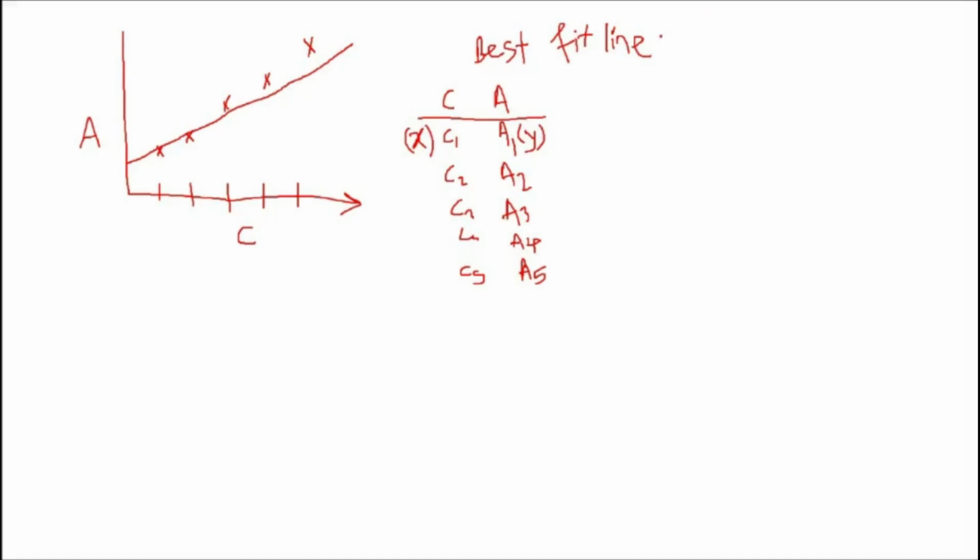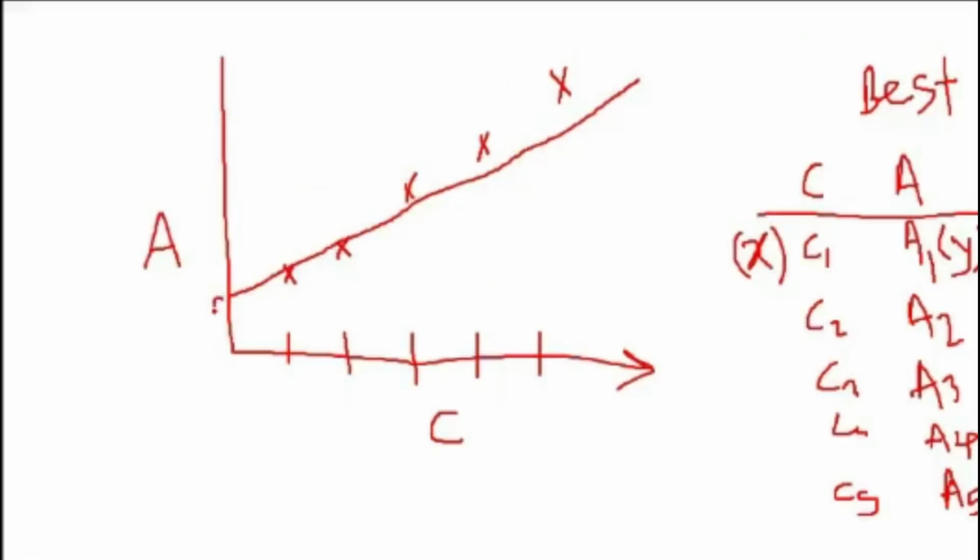We know that there is really a relationship between concentration and absorbance. So we should get a line which is equal to y = ax + b. Now you are very much familiar with this equation. Can you in the chat box tell me what is A and what is B? Okay, A is slope. Very good. Yes, B is y-intercept. That means like this is your y-intercept.